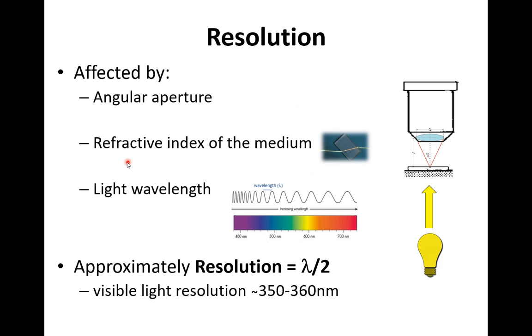But the biggest factor is also the wavelength of the light. That's the biggest factor that affects this. So in general, the larger the wavelength, the larger is the resolution.